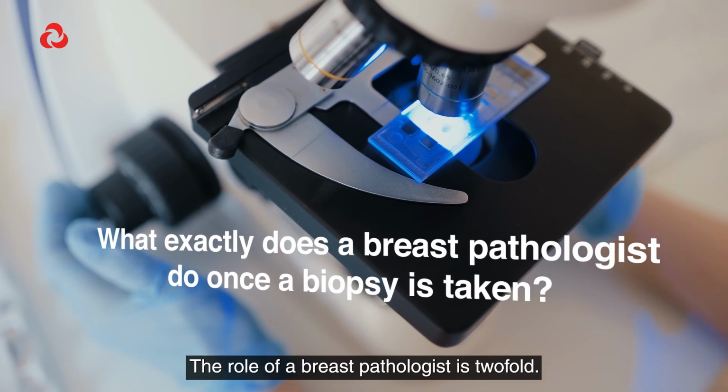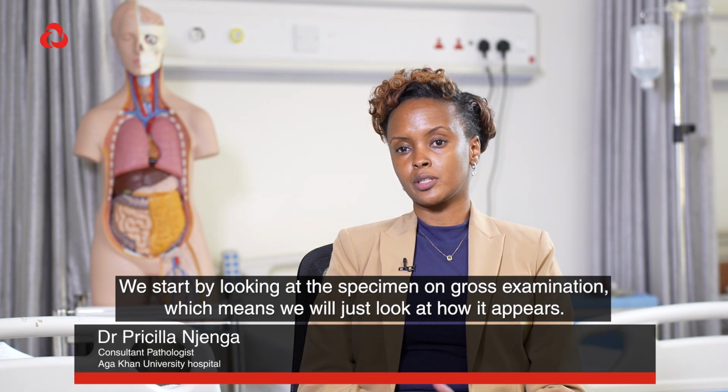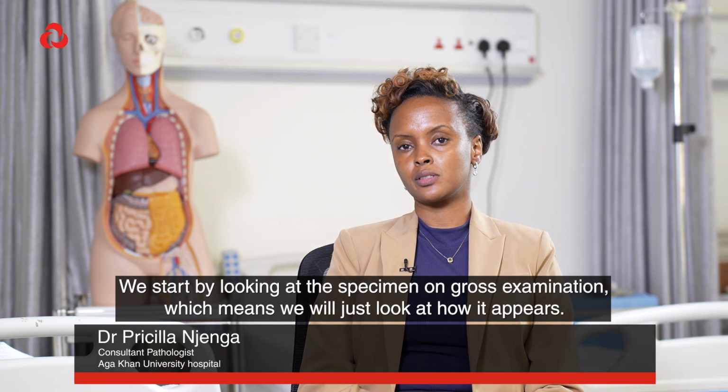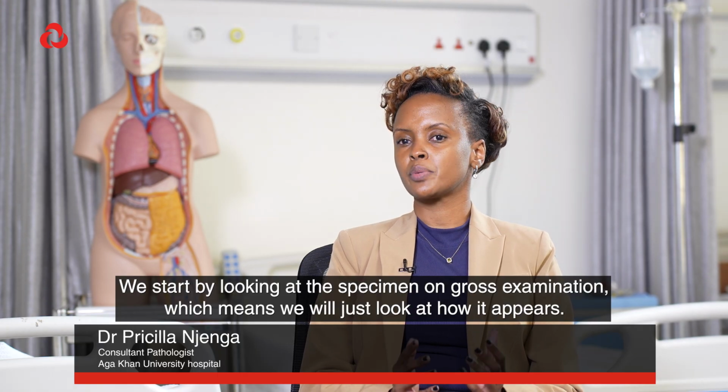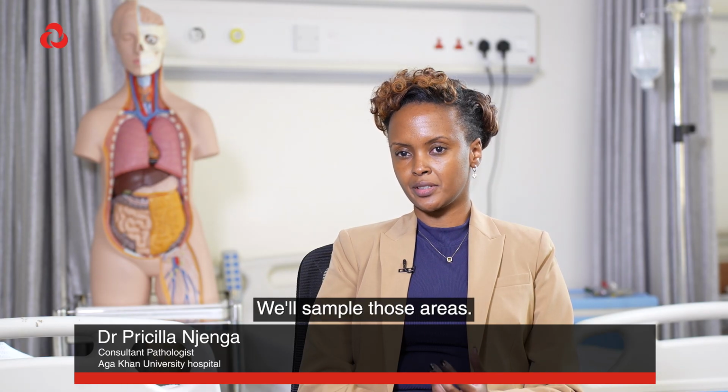The role of a breast pathologist is twofold. We start by looking at the specimen on gross examination, which means we will just look at how it appears. Are there any areas of suspicion? We'll sample those areas, okay?